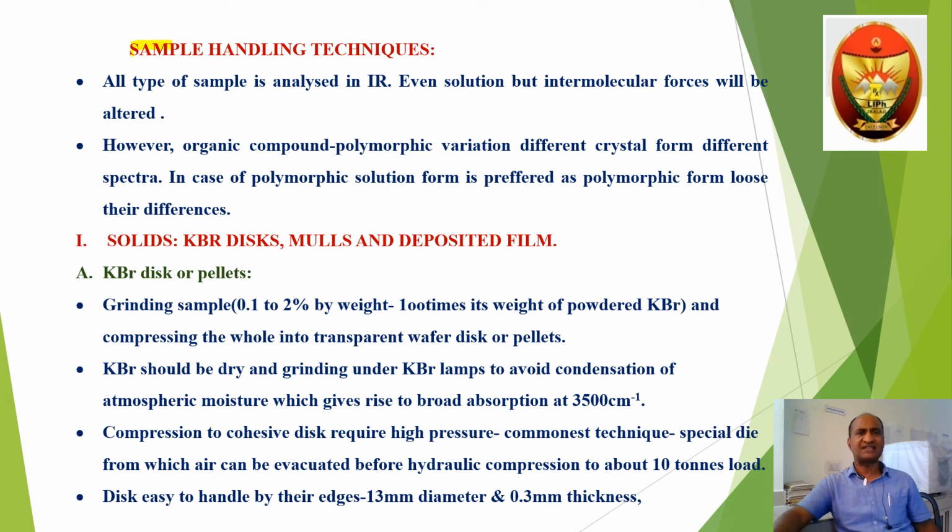Another important aspect is sample handling techniques in infrared. In infrared, we can handle solid samples, liquid samples, and gaseous samples. So all types of sample can be analyzed in the IR. However, we do not prefer the solution form as there is a change in the intermolecular forces. However, if the compound has polymorphic variation, that is different crystals giving different kinds of spectra, in such polymorphic cases, we can analyze in the solution form.